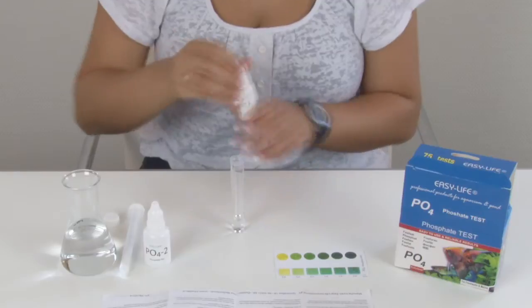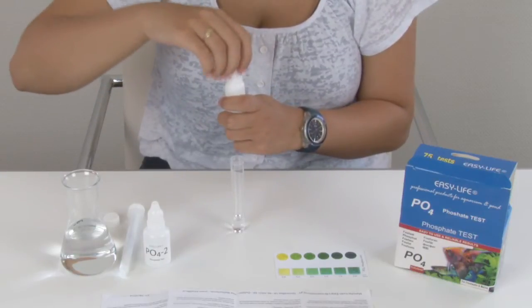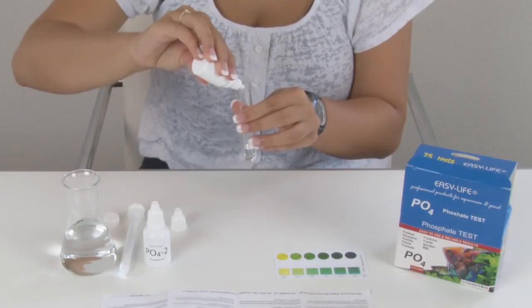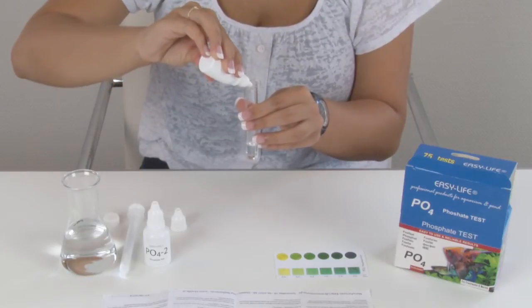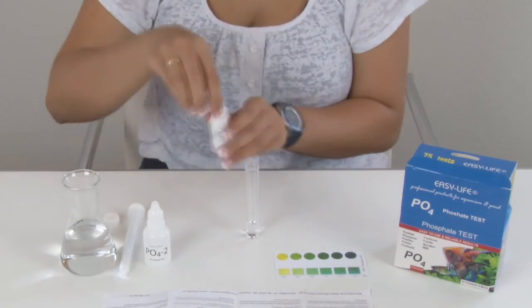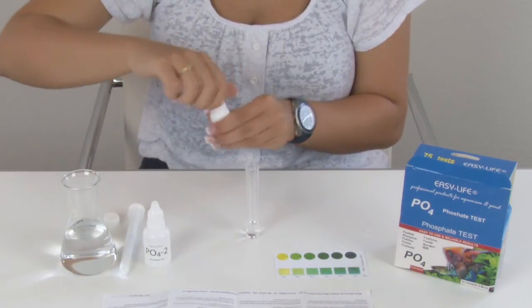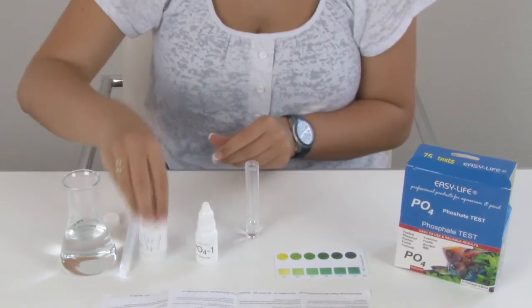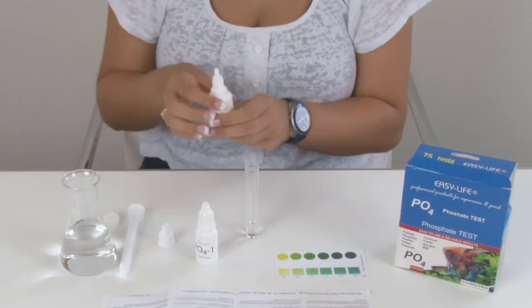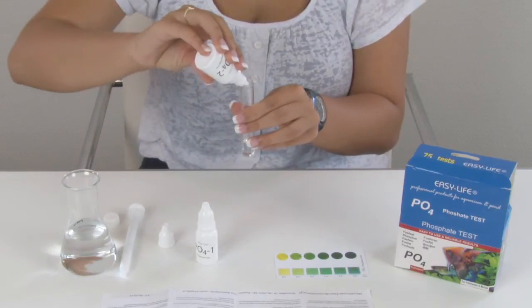Shake first and add now 5 drops of reagent PO4-1 under a 45-degree angle. Shake first and add now 9 drops of reagent PO4-2 under a 45-degree angle.